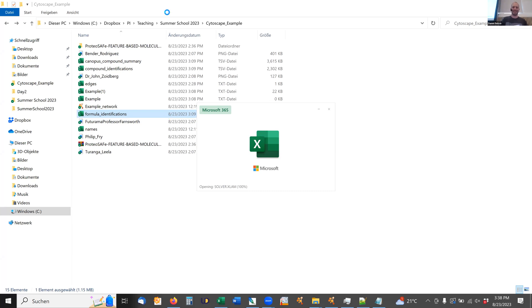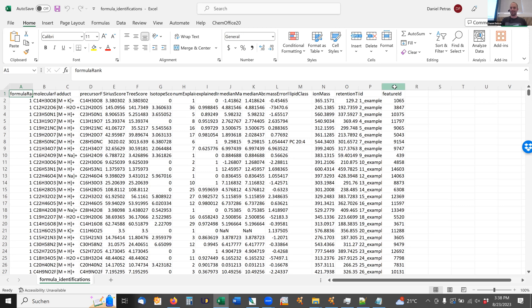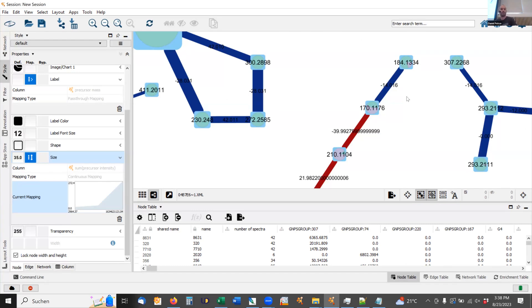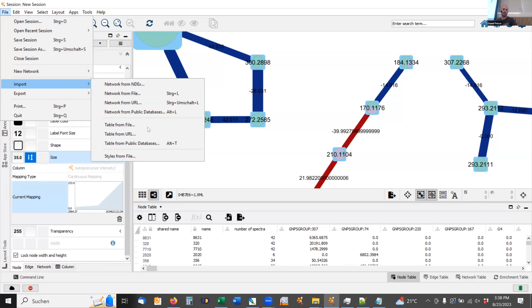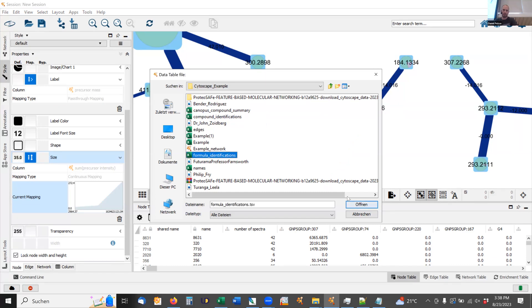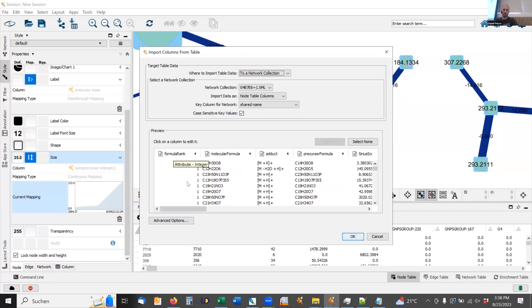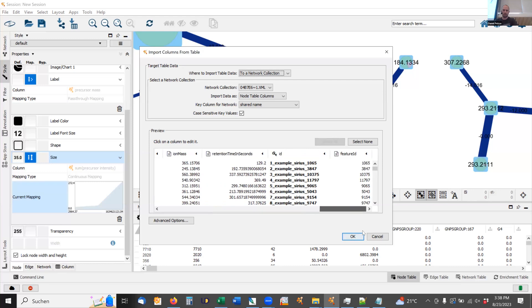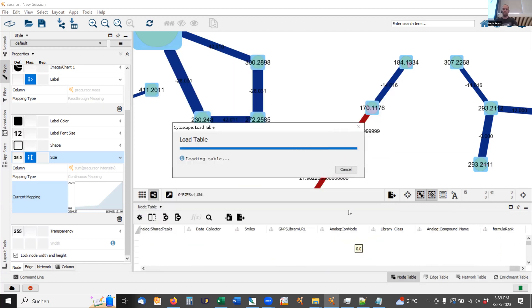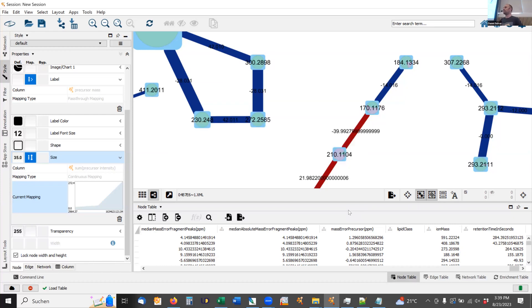Fortunately, we have Marcus and Fleming here to help. The last column here — feature ID — has the same number. So what we can do in Cytoscape, the same way as I did for the Futurama network earlier: go to File, Import Table from File, and directly select this SIRIUS output and bring it into Cytoscape. I just need to tell it which column is the key, and I want feature ID to be the key. Then it does a VLOOKUP or merge and actually merges all the SIRIUS information into Cytoscape.